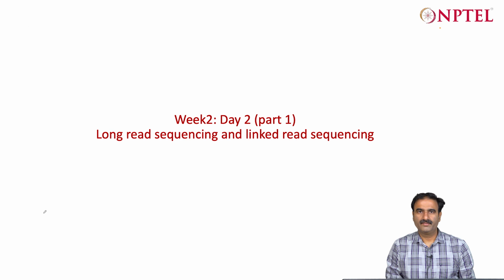Students, today we are in week 2, day 2, and in the previous class we have looked at the different sequencing technologies, mostly the first generation ones. So in today's class we will look at the next generation sequencing technology, which has even come after Illumina, and which is called long read sequencing. We will do a quick recap of what we did earlier and try to connect with today's class.